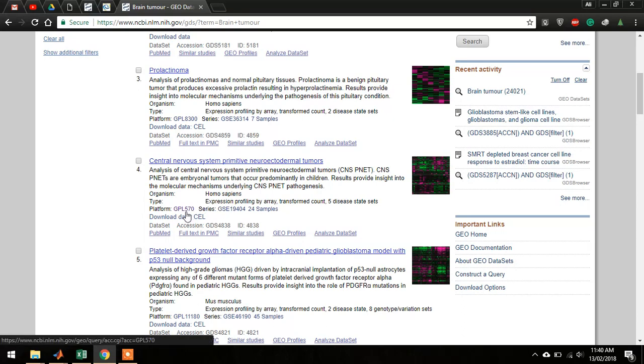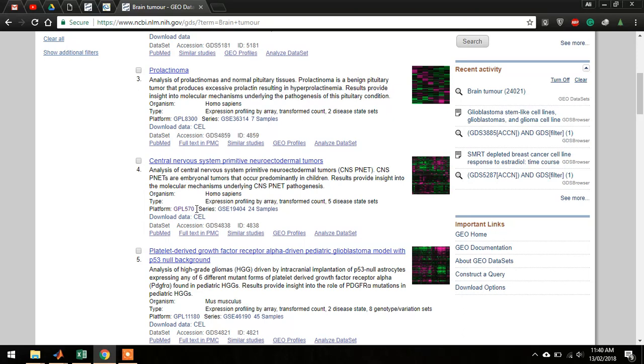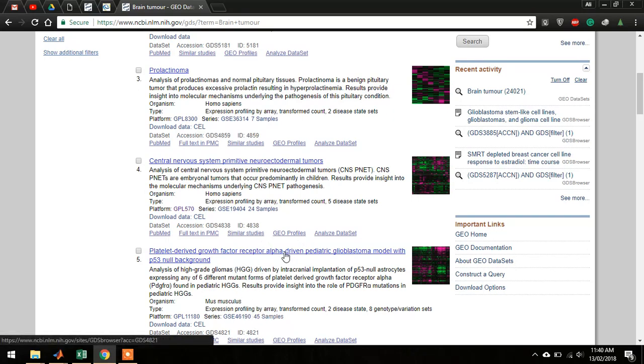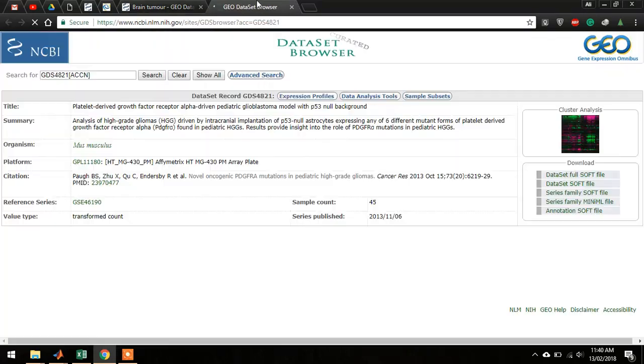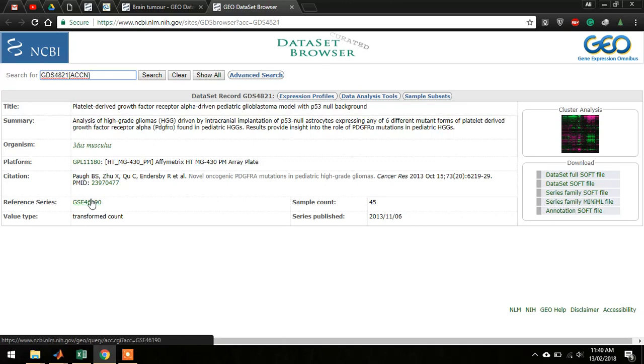This platform GPL570 contains all the gene symbols that we need. I will explain later. So let's take this example with 45 samples and open this link in a new tab. Then go to this platform right away.